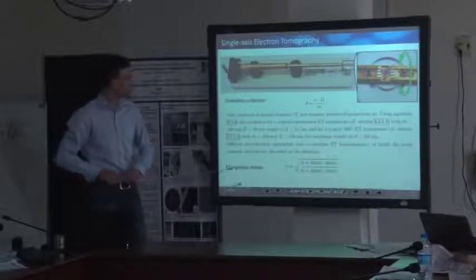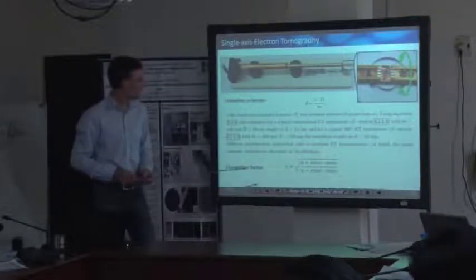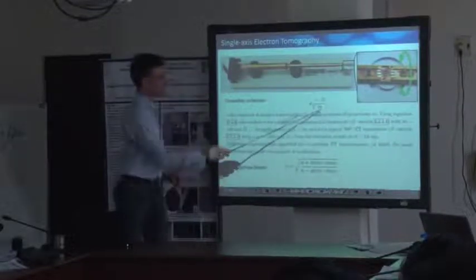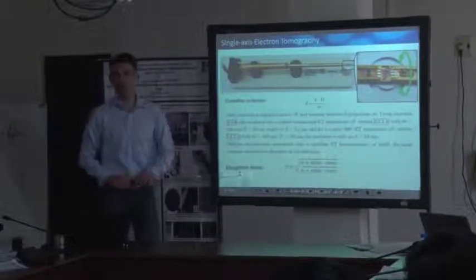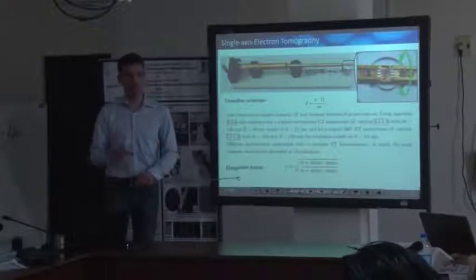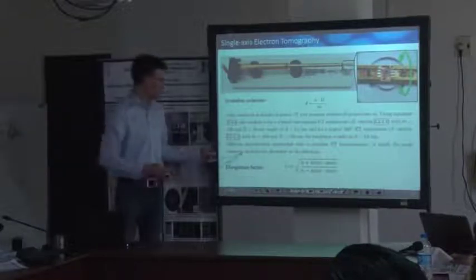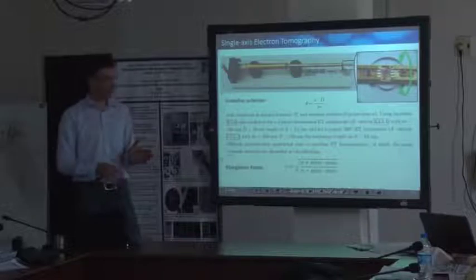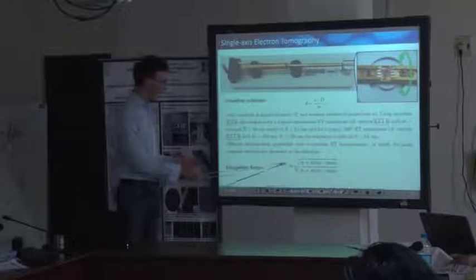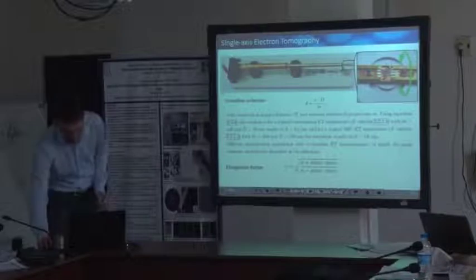What you can see, there's just one criterion shown. In principle, the number of projections here limits our final resolution in the tomogram. So the more projections we record, the better is the resolution. I mean, this is a general finding for electron tomography. And there is another aspect, this elongation factor due to this missing wedge. In principle, the larger this missing wedge is, the larger is this elongation of our structures, because we don't collect information in that direction.